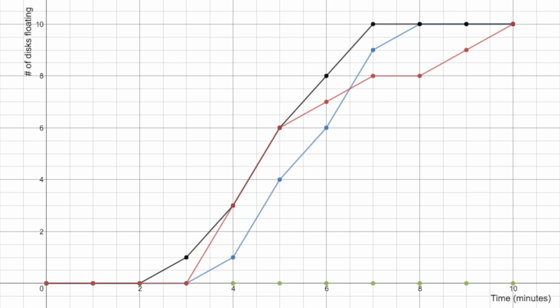Our experiment concluded as such, with the green dots being the control 0% solution, the blue dots being the 2% solution, the red dots being the 3% solution, and the black dots being the 5% solution. We can therefore conclude that an increased bicarbonate solution will result in increased photosynthesis, albeit very slight.